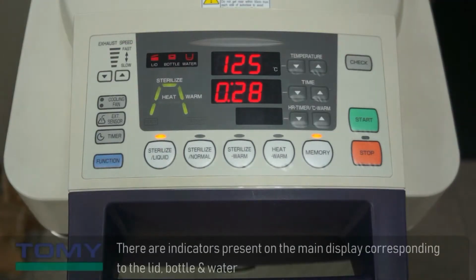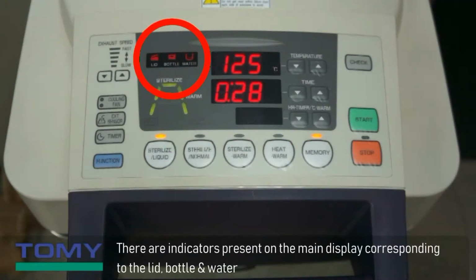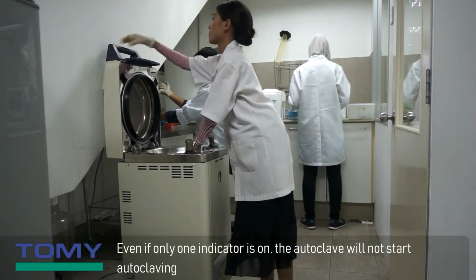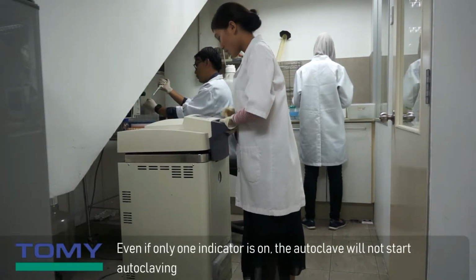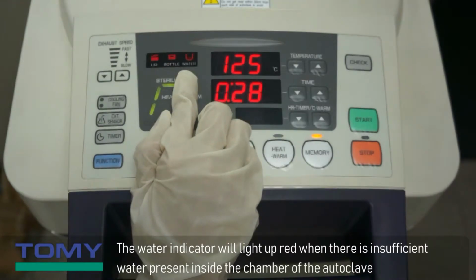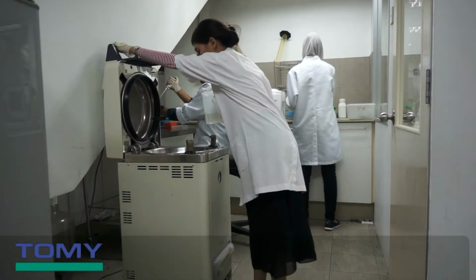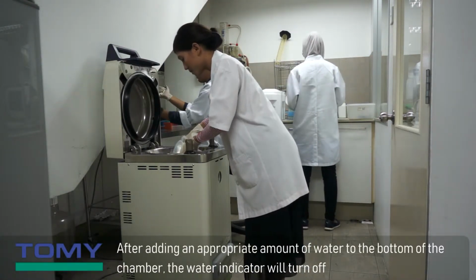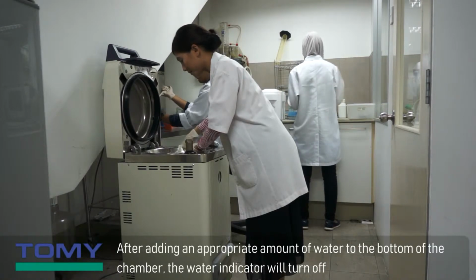There are indicators present on the main display corresponding to the lid, bottle and water. Even if only one indicator is on, the autoclave will not start autoclaving. The water indicator will light up red when there is insufficient water present inside the chamber of the autoclave. After adding an appropriate amount of water to the bottom of the chamber, the water indicator will turn off.